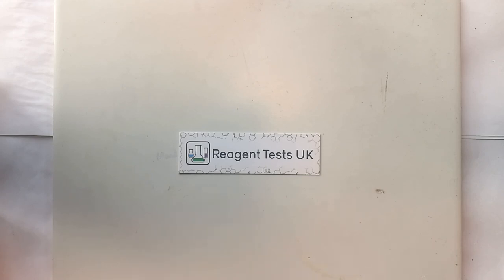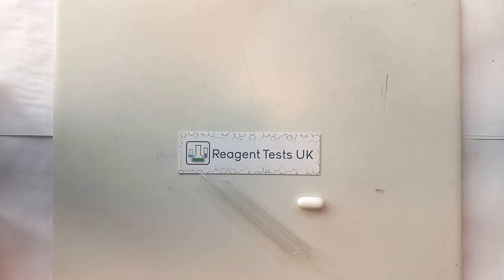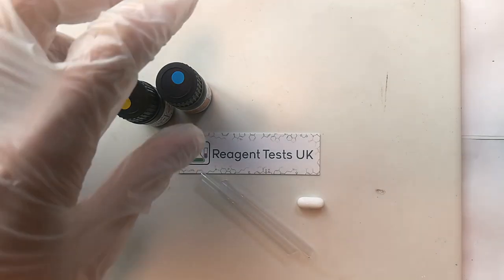You absolutely wouldn't be able to drink it but if you then get that water on your skin it's not a concern and it can be rinsed off at your convenience. You'll also need the micro scoops that come with the kit and a sample that you want to know more about the identity of and, of course, the reagents themselves. It's always important to use more than one reagent and I'll come on to why that is in a few minutes.